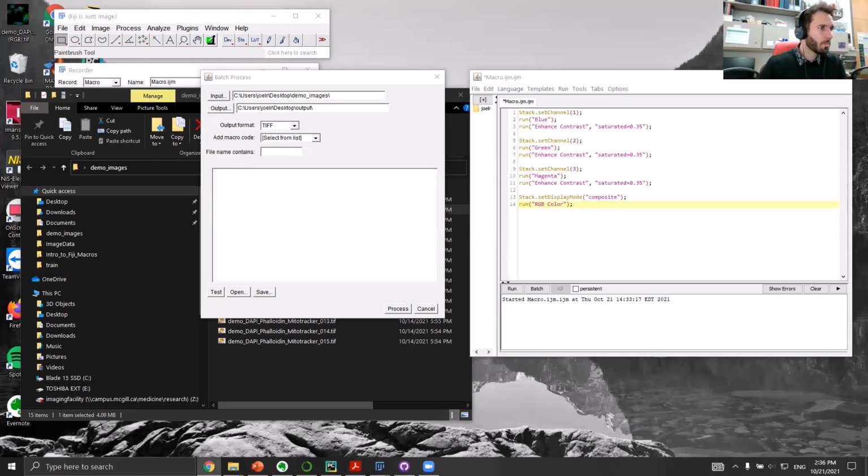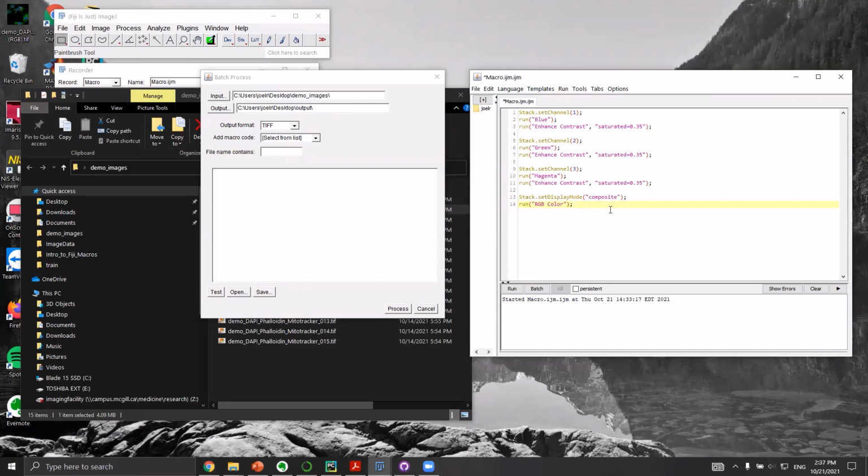All right. Is it possible to do enhanced contrast manually during run? It's not easy to do things while the script is running. We will show in exercise 3 how to insert a break to allow you to either adjust the contrast or do things a little bit later. So this was a question from Nariki. Is it possible to do enhanced contrast manually during the run? Not so much. Once your thing is running, it's going to do this enhanced contrast command in a straightforward way. We'll see if that kind of works out.